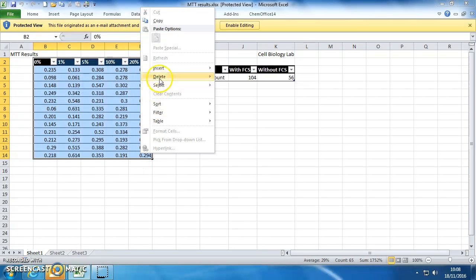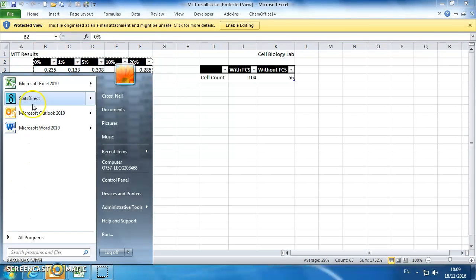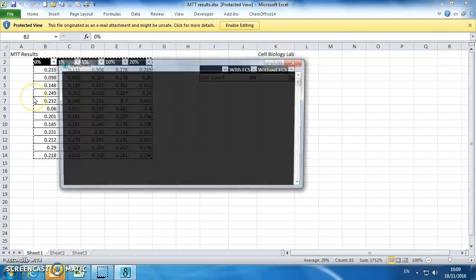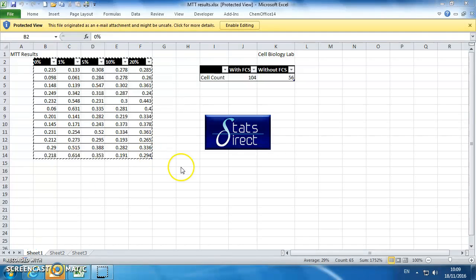All we're going to do is copy that out, open up StatsDirect. This software is only available in 757.